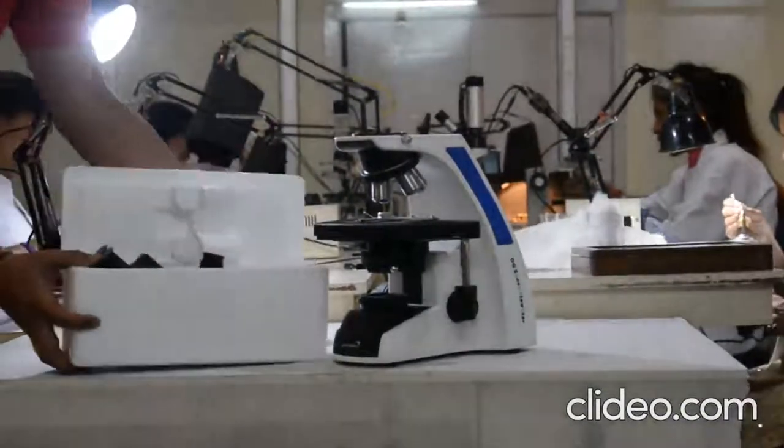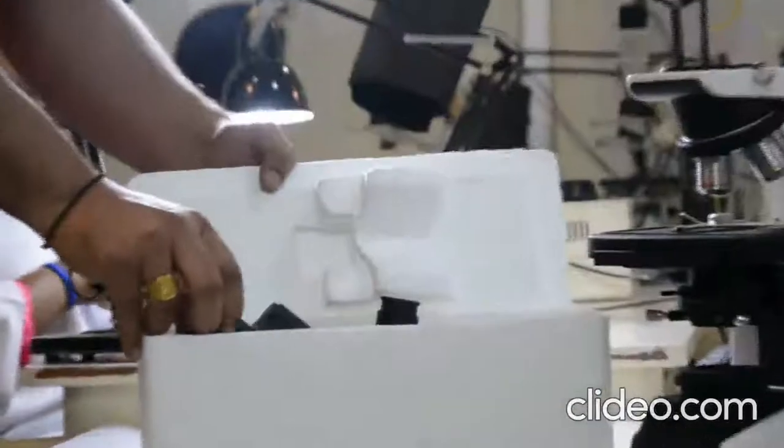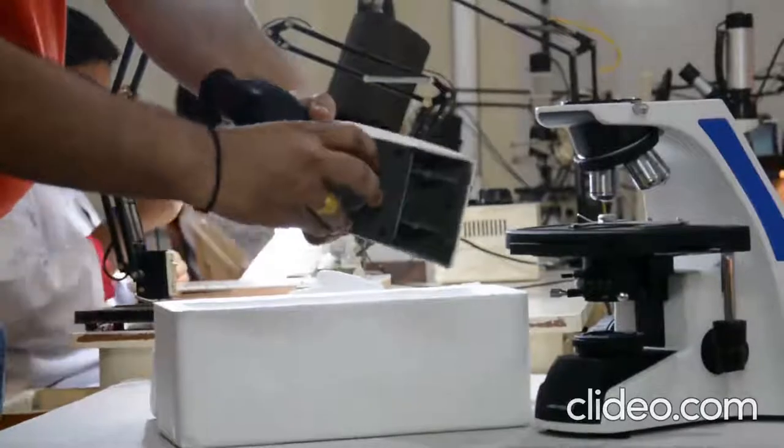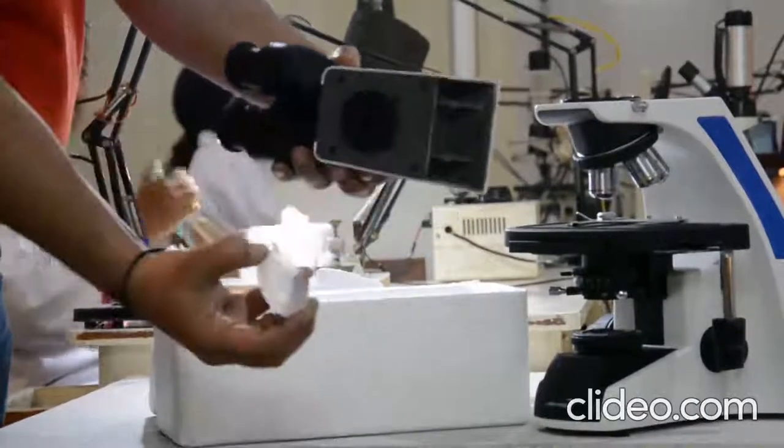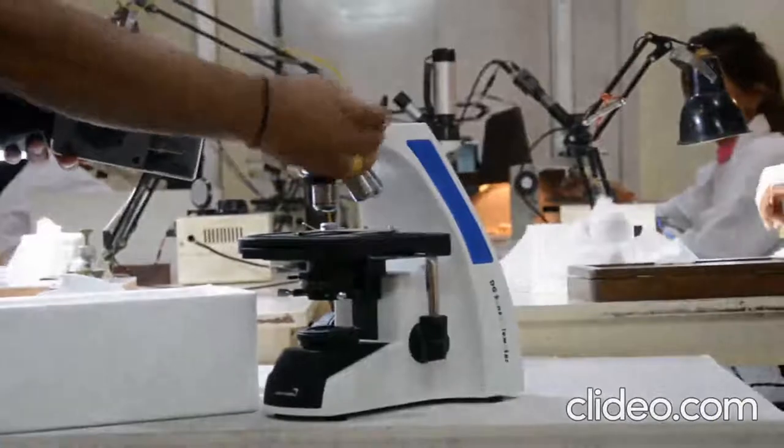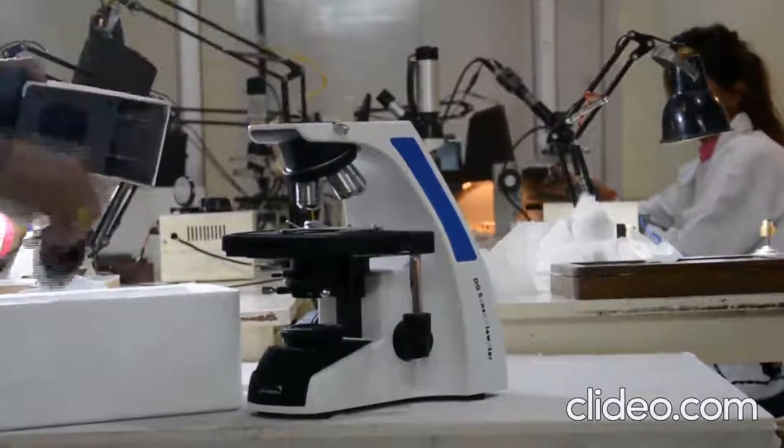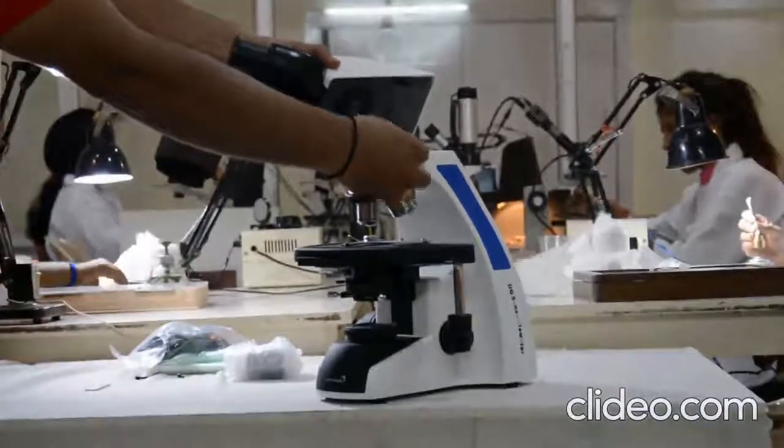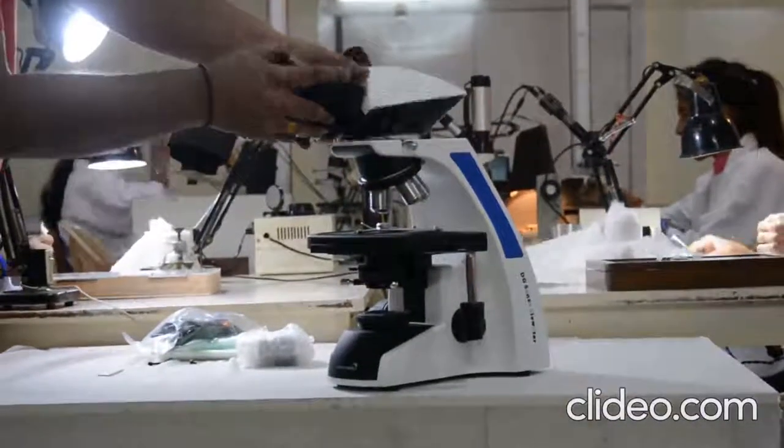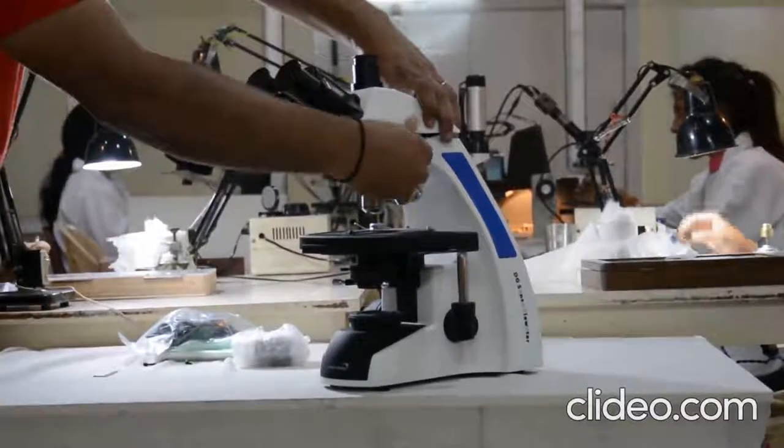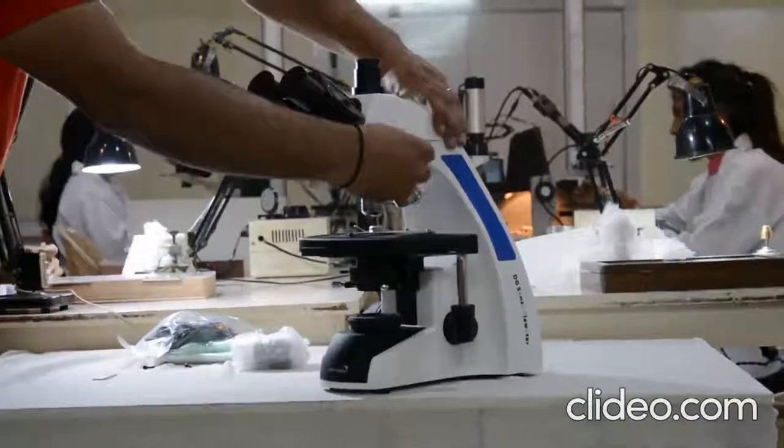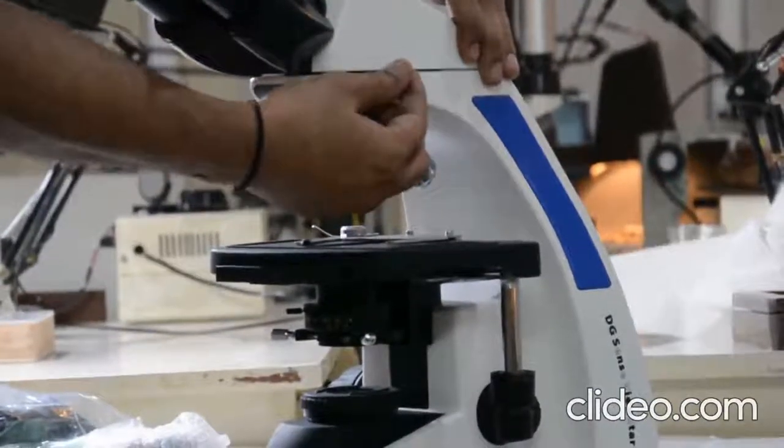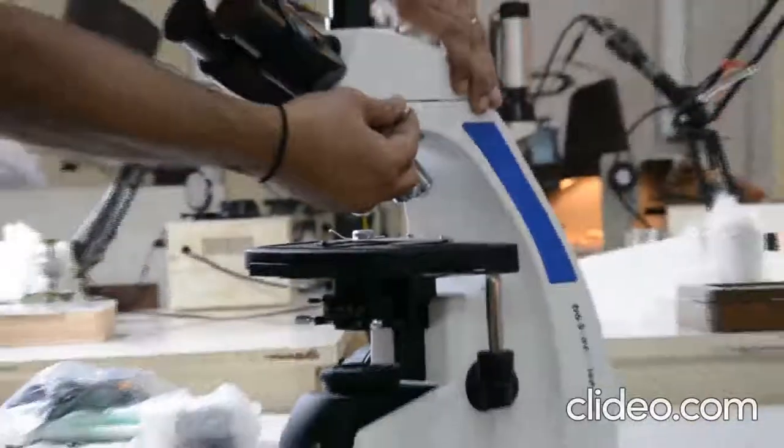Now we will open the other attachments. This is the trinocular head of DesiSense View Star. You have to take out the cap cover. Take out the cap cover from the top. You have to put the head in the same section and tighten the screw. And check if the head has been attached properly.